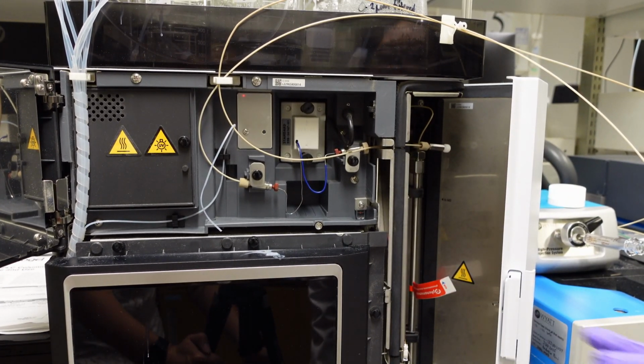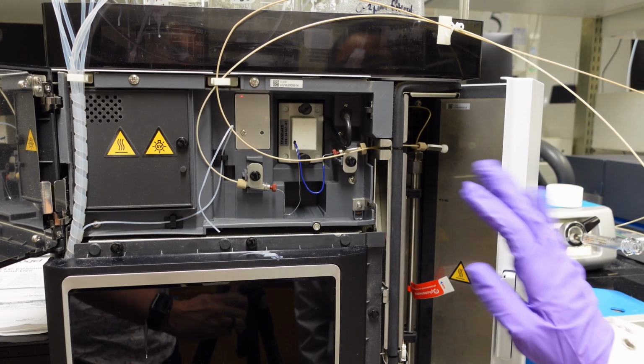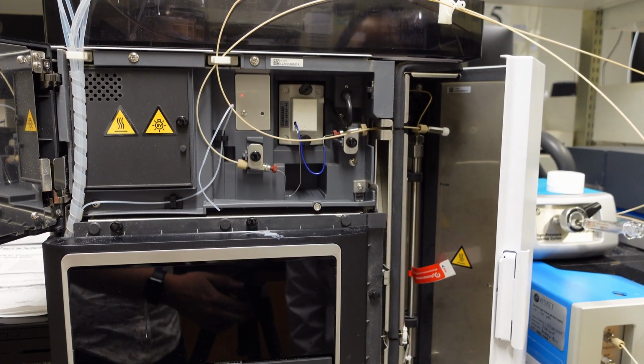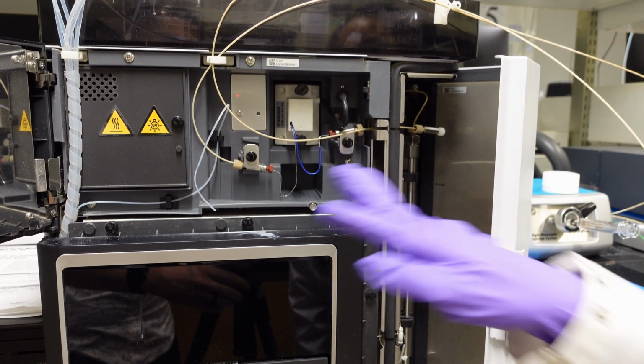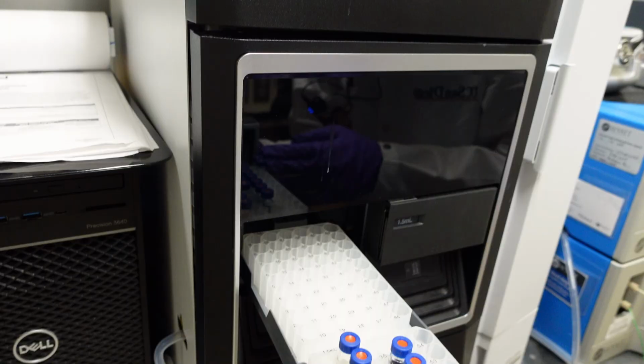There are a lot of different columns, so you can choose the one that's correct for you. But one thing, you want to check all the tubing and make sure it's all going to the places you want it to go, whether you do or don't want it to hit the UV detector, things like that.